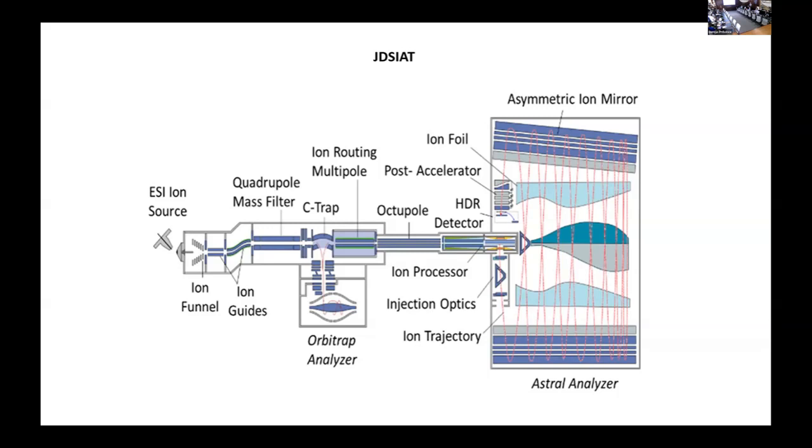The truly novel thing to me on this TOF is that I think of TOFs running at high voltages, tens of kilovolts. I think this runs at 5 or 6 kilovolts and then has a post acceleration to the detector. But they do a really good job of keeping the ion cloud diffuse enough that it doesn't have ion-ion interactions, but tight enough, and the ion cloud gets folded in on itself to keep the dispersion down. So very clever. Newsflash, Makarov's pretty sharp.